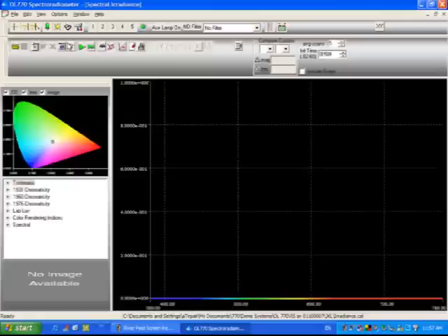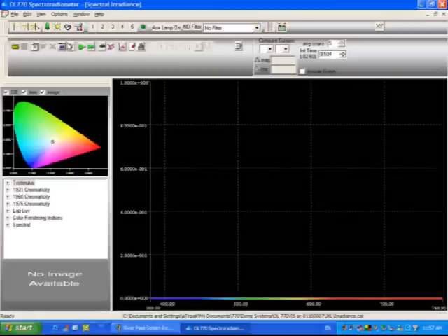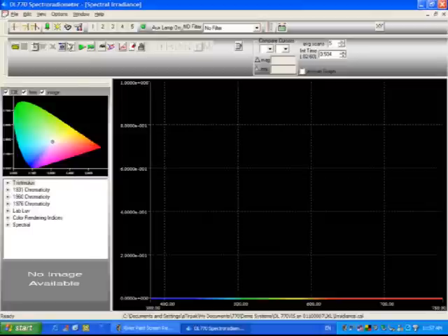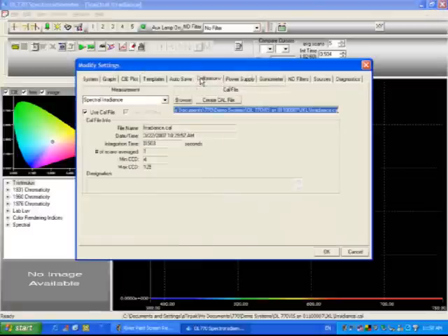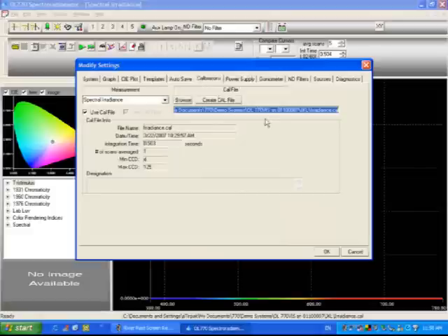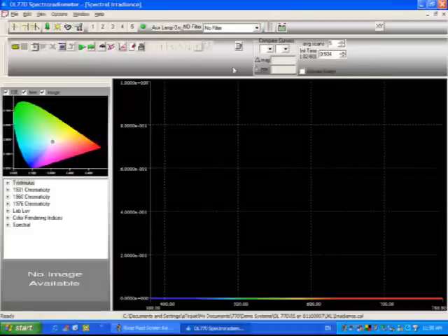Now I'm not going to do a calibration as I did with TLF because it's identical to the TLF calibration, but I will check really quickly to see if we have our calibration file loaded. Let's go back to modify settings, calibrations, and we do in fact have the irradiance file here loaded. I'll click OK.